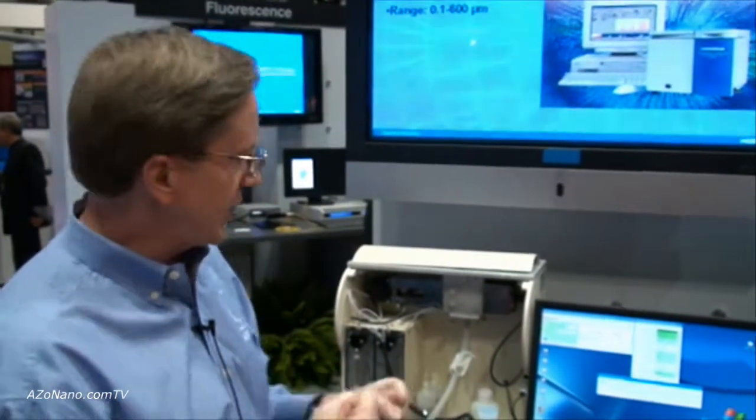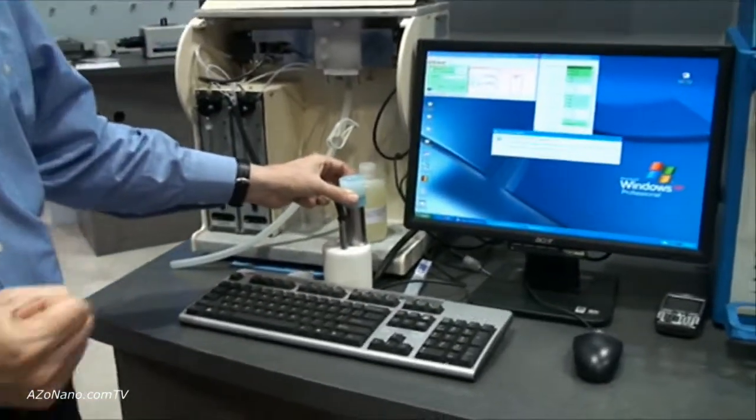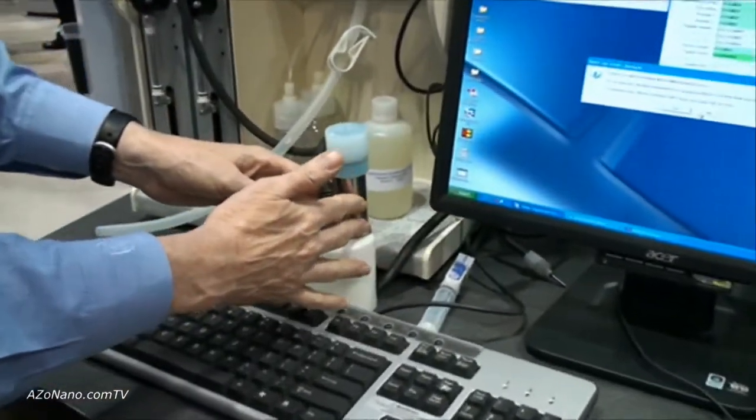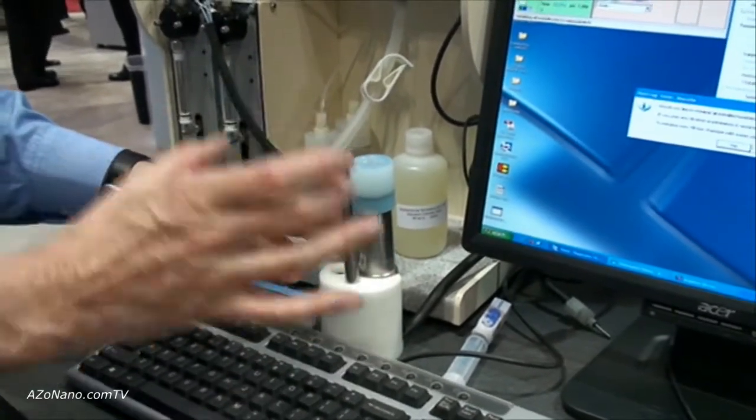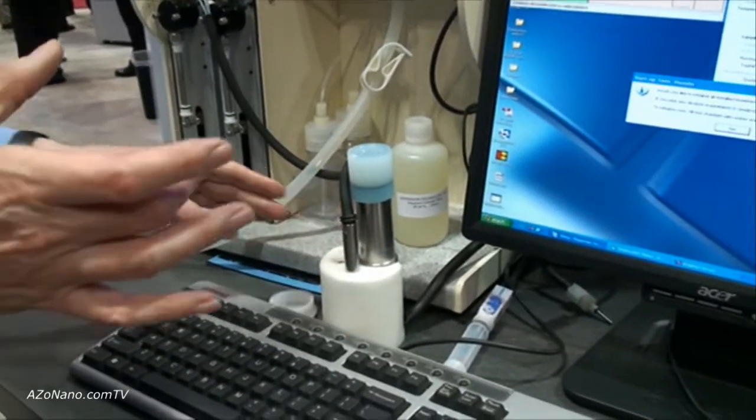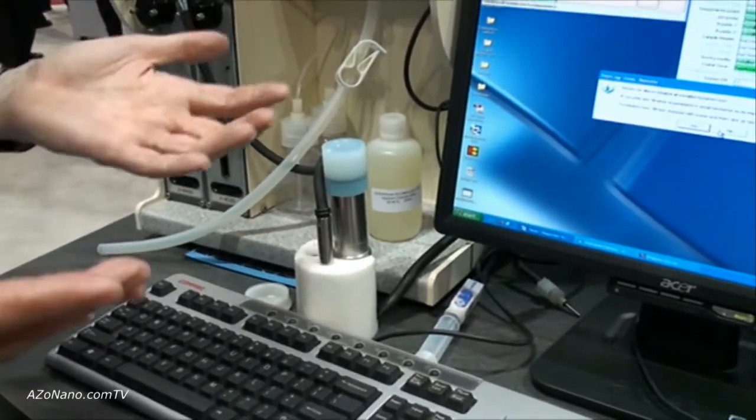And in order to measure that charge on the surface we're going to measure the zeta potential, the charge on the surface of the particles. This is a sensor designed to measure the zeta potential samples again without dilution which is a critical improvement when measuring zeta potential because if we were to dilute the sample we could change the charge on the surface through the dilution process.